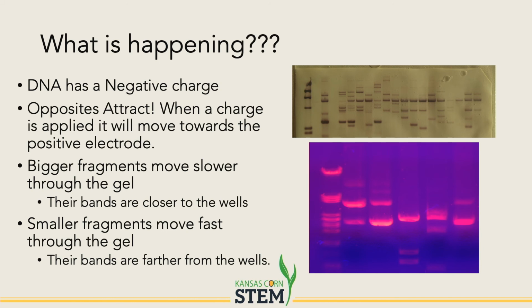If the restriction enzymes have cut the DNA in the exact same sequence of bands, we know it has to come from the exact same organism. If the restriction enzyme cut them in different bands, then we know it came from different organisms. The more restriction enzymes you use, the more bands you get, and the more variety that you can see in those individual DNA sequences.